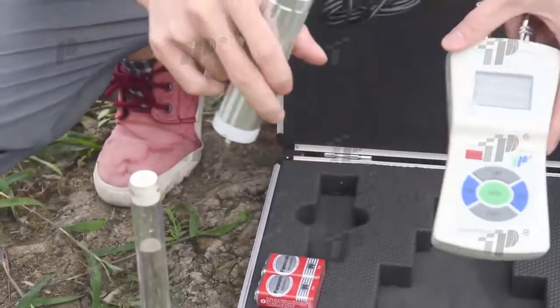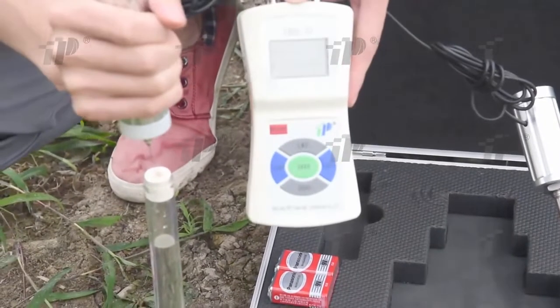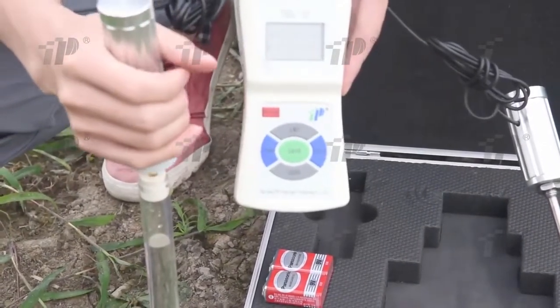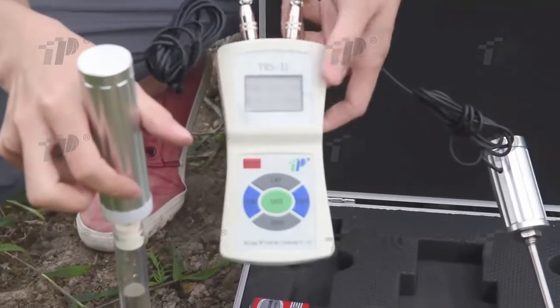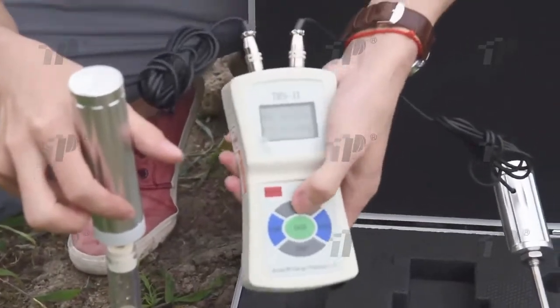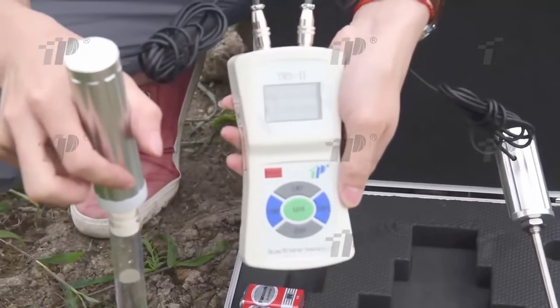After the water potential probe is embedded in moist soil for 1 hour, you can test the soil water potential. During testing, insert the aviation socket of the water potential sensor to the upper left socket of the displayer.